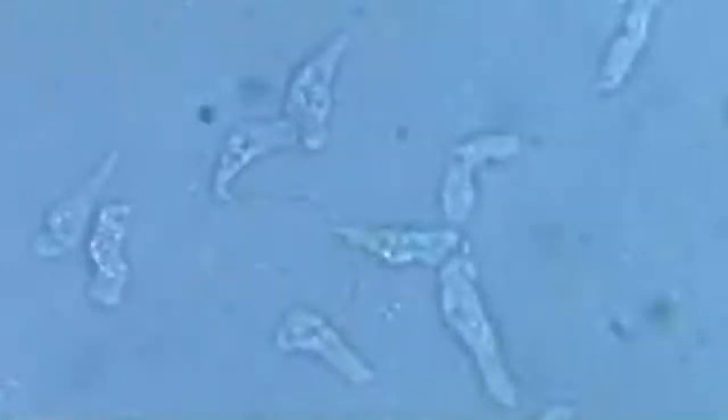A few paramecia and lots of amoeba. And this was all in less than a drop of water, I tell you. Less than a drop of water. The water drop was held between the tips of a pointed forceps. I love watching amoeba and live streaming them because they are so fascinating to watch.